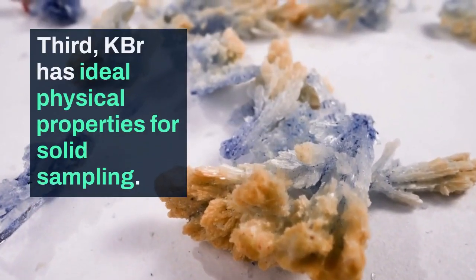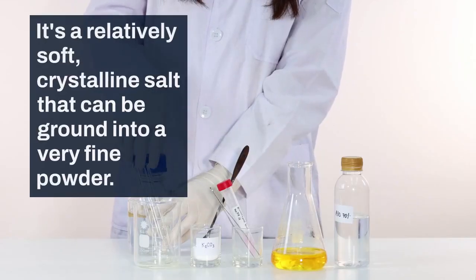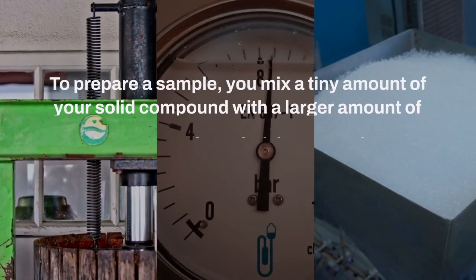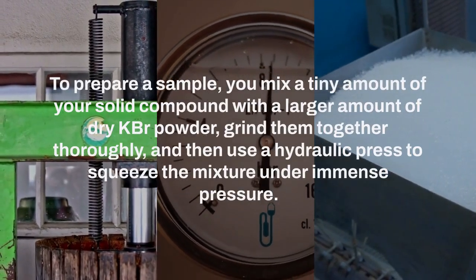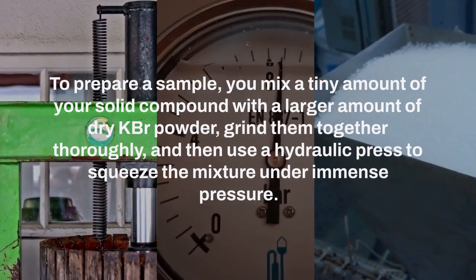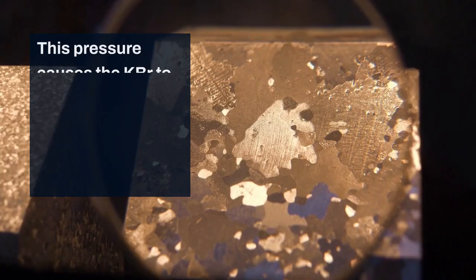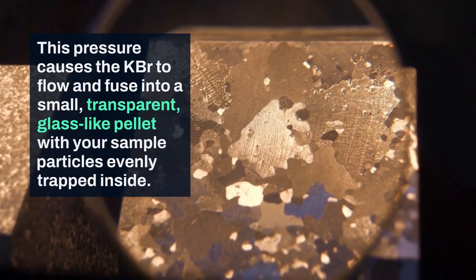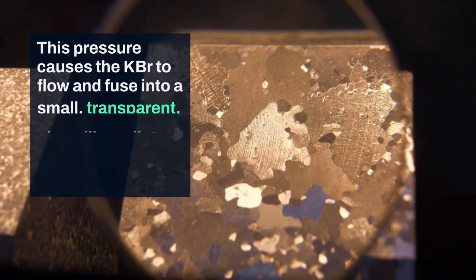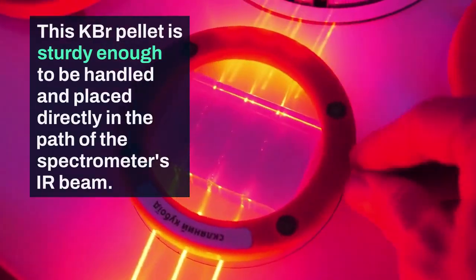Third, KBr has ideal physical properties for solid sampling. It's a relatively soft, crystalline salt that can be ground into a very fine powder. To prepare a sample, you mix a tiny amount of your solid compound with a larger amount of dry KBr powder, grind them together thoroughly, and then use a hydraulic press to squeeze the mixture under immense pressure. This pressure causes the KBr to flow and fuse into a small, transparent, glass-like pellet with your sample particles evenly trapped inside. This KBr pellet is sturdy enough to be handled and placed directly in the path of the spectrometer's IR beam.